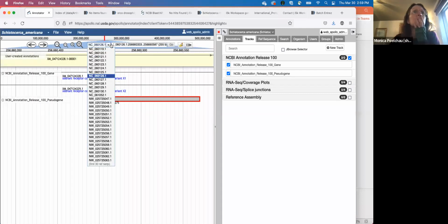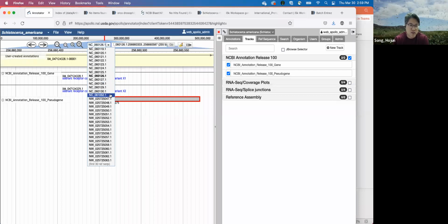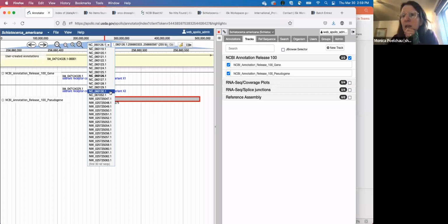We'll probably search for something like the CO1 gene against the nuclear genome. You do have a mitochondrial genome in this assembly, right? Do you remember what the identifier is? Actually, let's just go check.